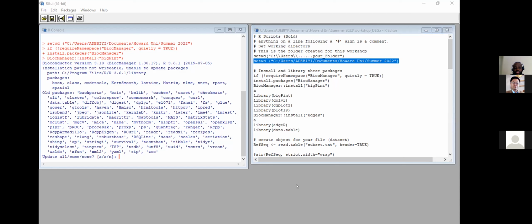It's called a subset. Can you see it now? Yes. I just sent it so you can just download that. Just the first small file.